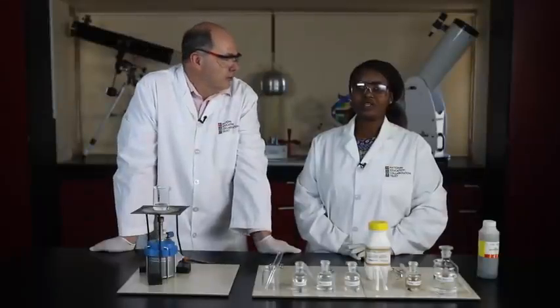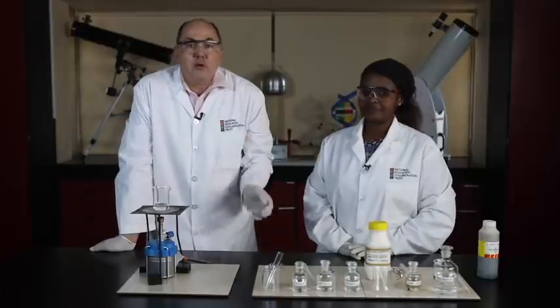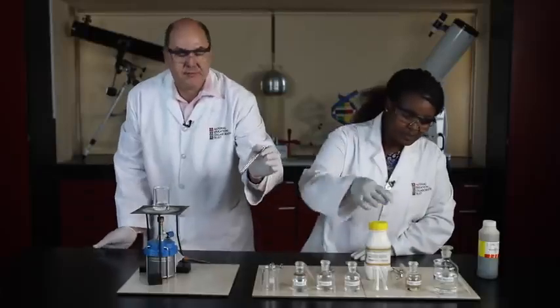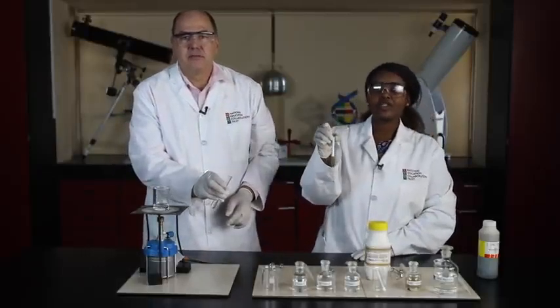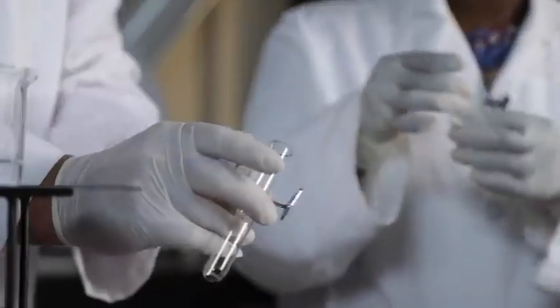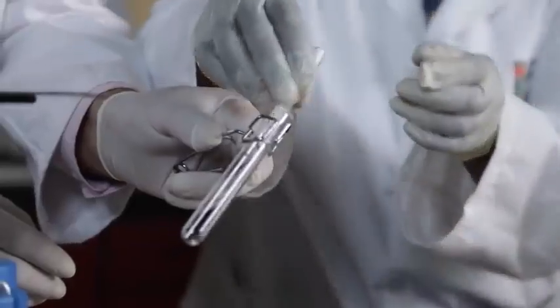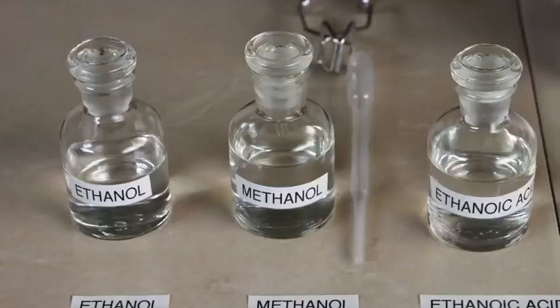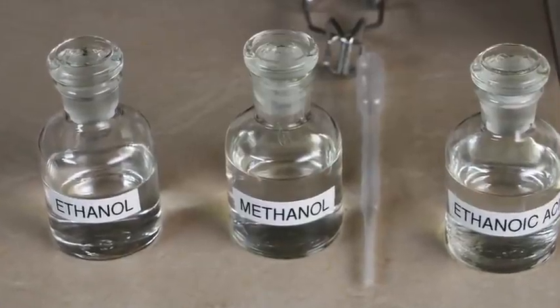When we work with a solid acid, we need to change our method slightly. Of course, we first start with a dry, clean test tube. Here it is. We have measured 0.5 grams of salicylic acid to use in this reaction. So we'll add the salicylic acid to the test tube. Okay, let's take some of the methanol and rinse out the rest of the acid there.